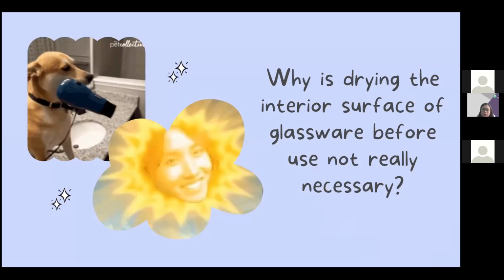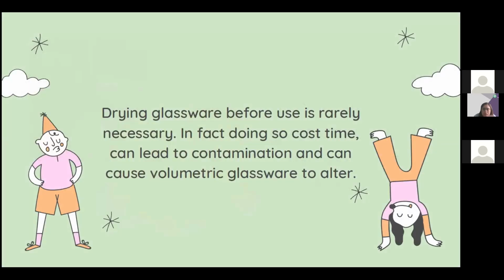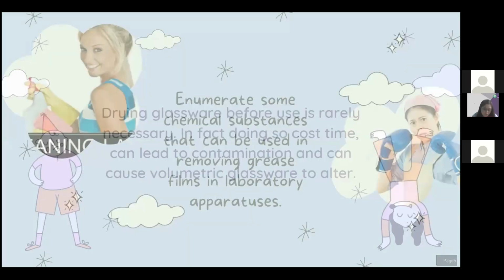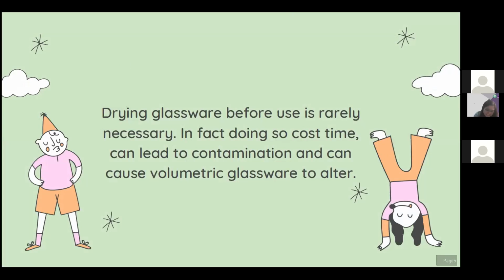So next question is, why is drying the interior surface of the glassware before use not really necessary? Because drying glassware before use is rarely necessary. In fact, doing so costs time and can lead to contamination and can cause volumetric glassware to alter.